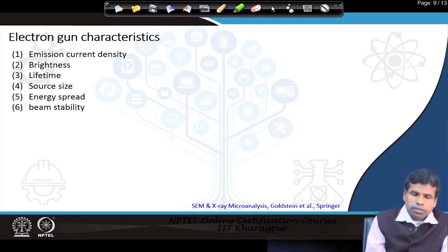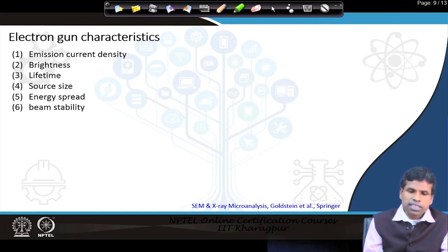Third is the lifetime, what would be the lifetime of this gun, and the source size. Source means the filament size at the tip, where the electrons are generated. Then we have energy spread, how much the energy of the generated electrons is spread, and then beam stability, how stable is the electron beam generated from the emitters. These are the important gun characteristics that determine the performance of a microscope.